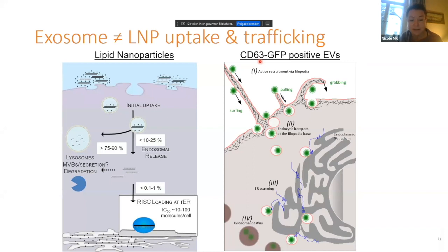And already then we realized, like many others in the field, I think, that tracking single vesicles is something that's extremely powerful to unravel the biology and to really understand the fate. So drug delivery through extracellular vesicles clearly has an enormous potential, because we're dealing with something that's fundamentally different from anything synthetic and more reminiscent of highly infectious pathogens. So Melanie, if you can advance once more, perhaps.